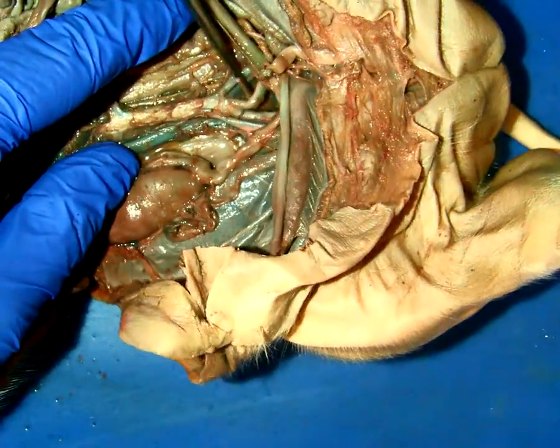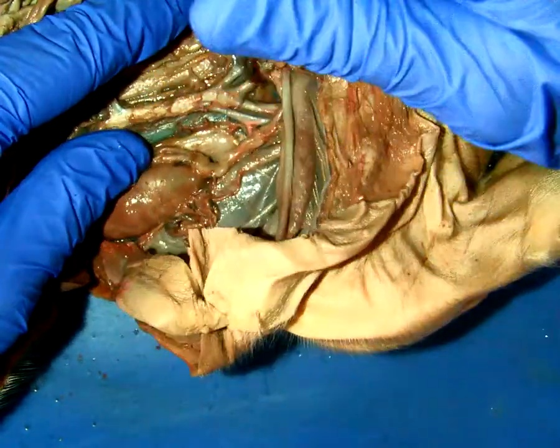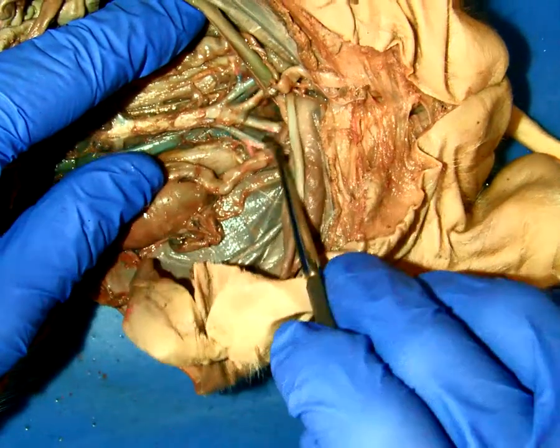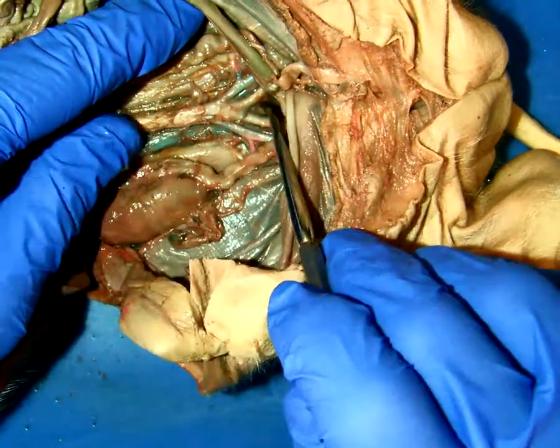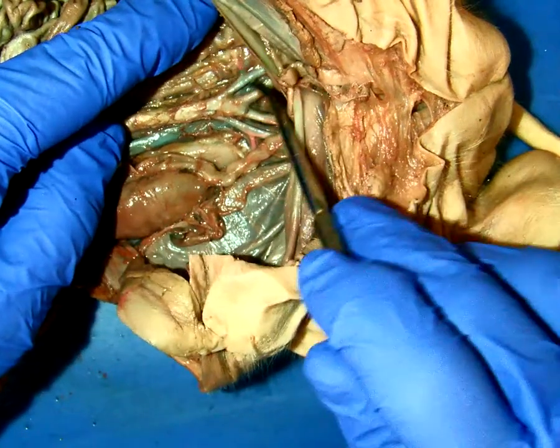So they actually look different, right? So here's a left internal, sorry, I'll try to get that. A left internal and a right internal. So very nice here, but they separate off like this, all right? The venous, and you don't need to trace these into the legs, so that's pretty much good enough.